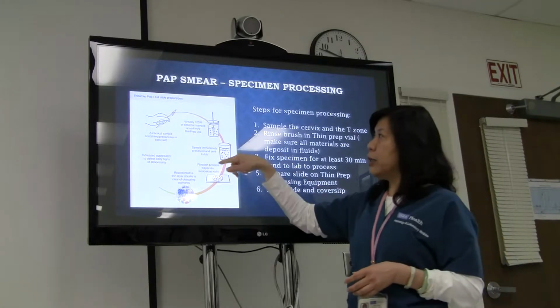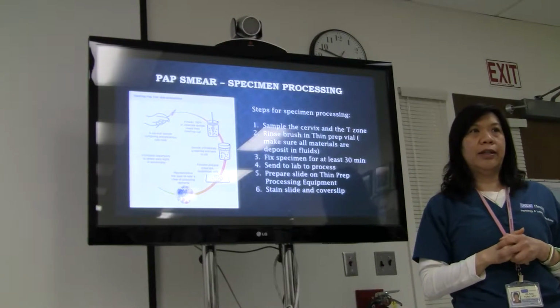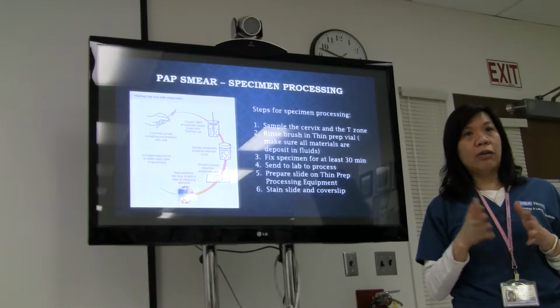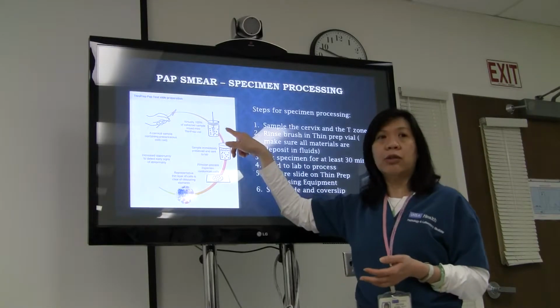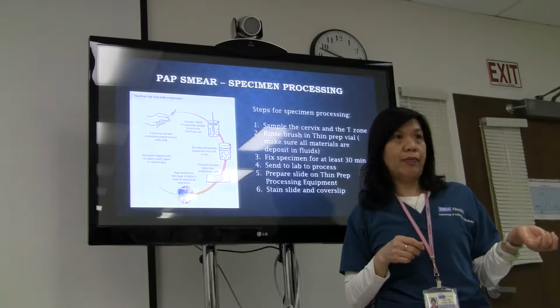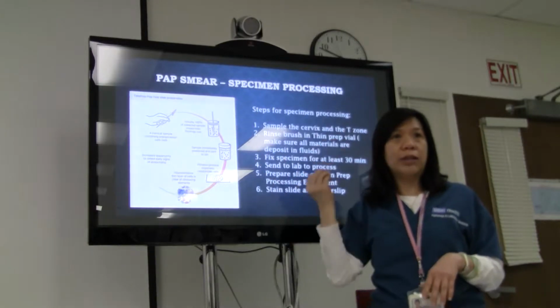Now, if they're doing this, does that mean all 100% of the material is being transferred into the fluid? Probably not. But at least now, I would think that at least 80 or 90% of the cellular material is being transferred into this solution, and only 10% gets left on the brush and thrown away. It's almost impossible to get 100% of the brush material because something always gets stuck.